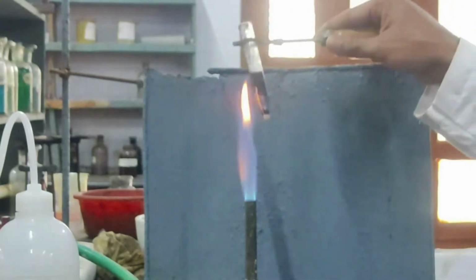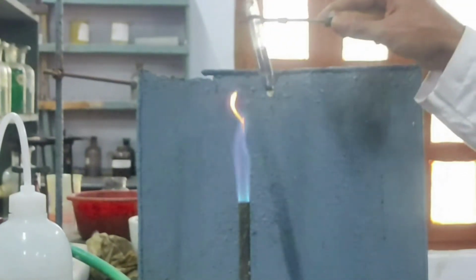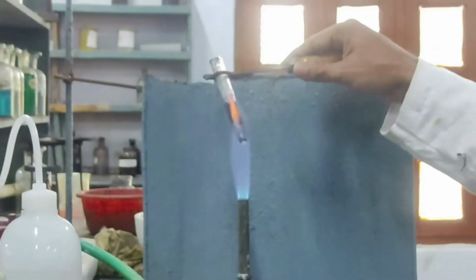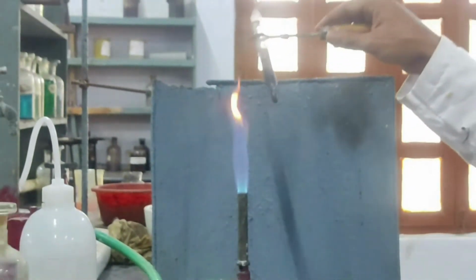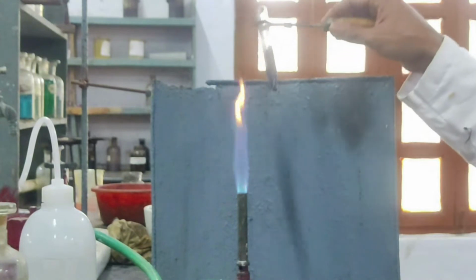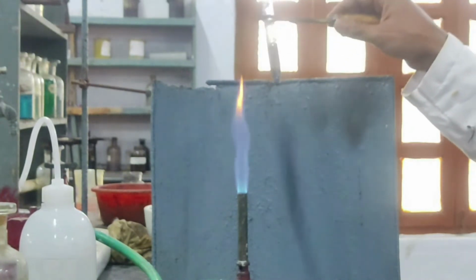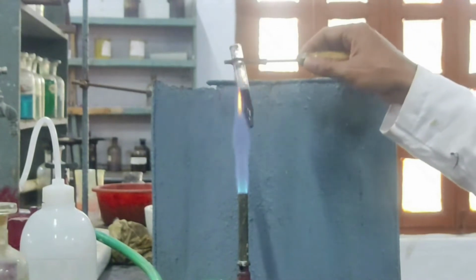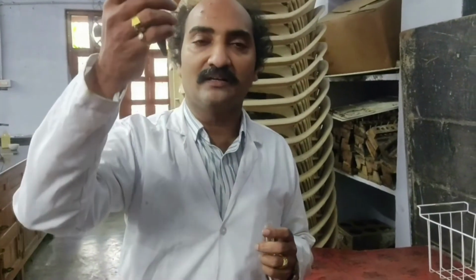It should be an on and off type of heating such that the contents do not spill on your neighbors. So to the 4th group residue, I have added a few drops of dilute HCl and then I heated that solution for 1 to 2 minutes.